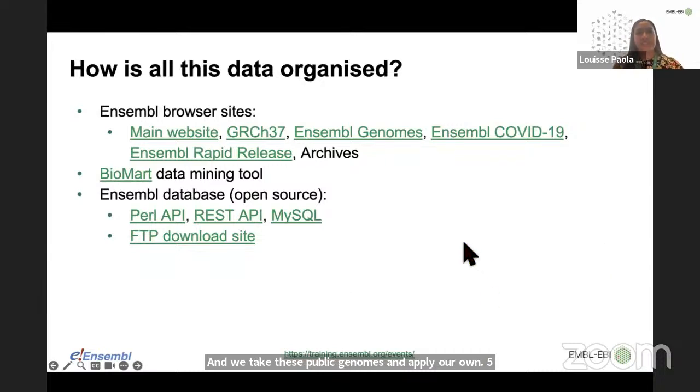So Ensembl data is organized in a very structured way, and there are different sites that you can visit. As mentioned, we mainly looked at the Ensembl Plants browser, and this is part of the Ensembl Genomes website. The Ensembl Genomes website is dedicated to non-vertebrate species. If you are ever going to work with vertebrate species, you can access the Ensembl main site. This is just ensembl.org.